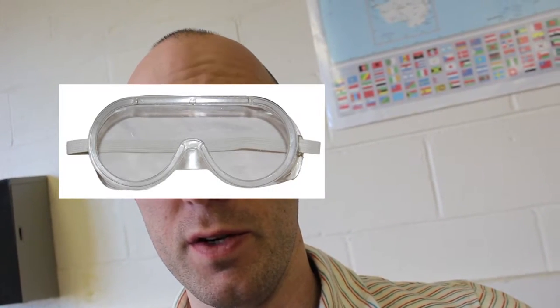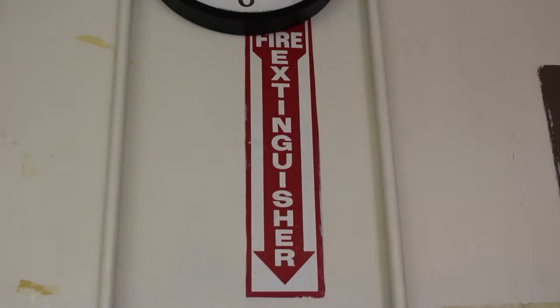Also, when you're in a real science classroom and not just being silly on YouTube, wear some safety goggles — it's the right thing to do.